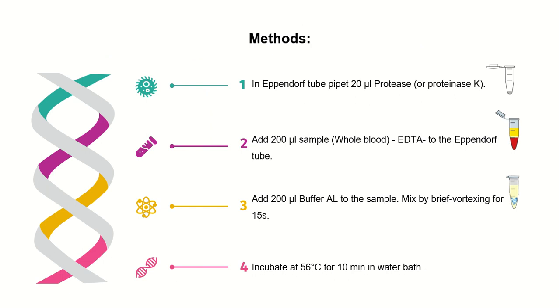In an Eppendorf tube, pipette 20 microliters of proteinase K.